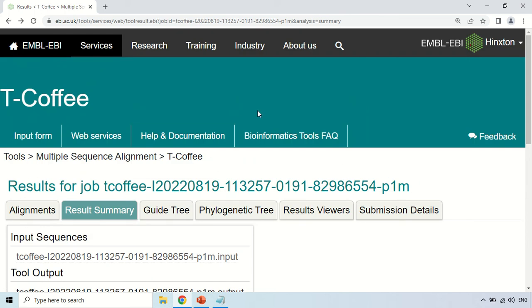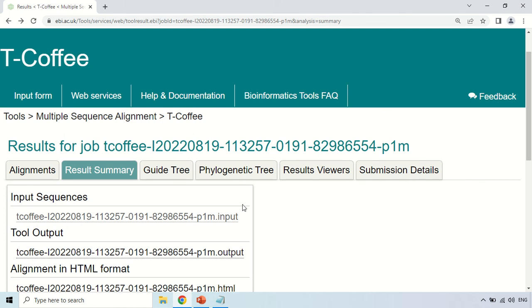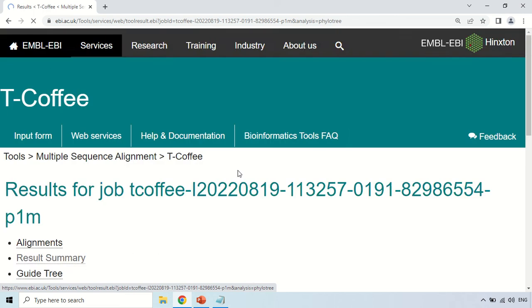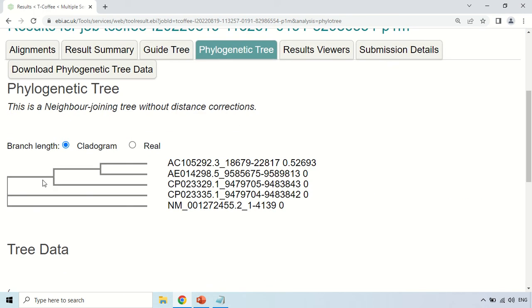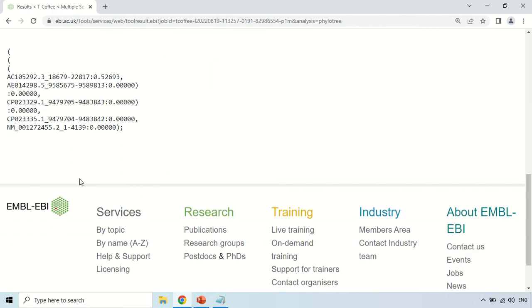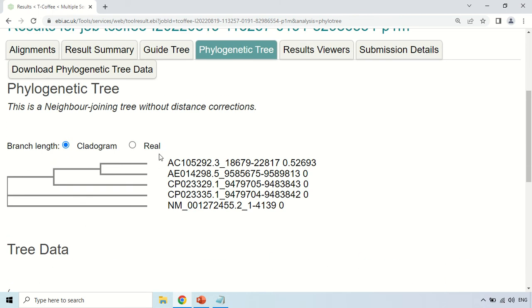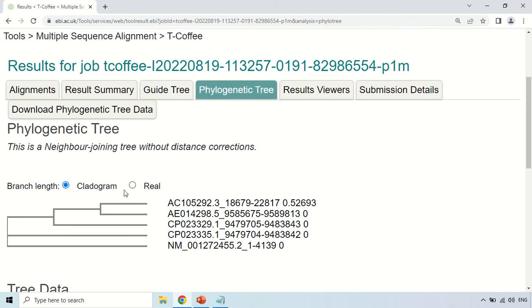The next section is Phylogenetic Tree. By using T-Coffee, you can also construct a phylogenetic tree. Just click under the Phylogenetic Tree section. Now you can see the phylogenetic tree of all five sequences, with their accession numbers shown. This is the tree data and the phylogenetic tree or cladogram. You can also download the phylogenetic tree data by clicking 'Download Phylogenetic Tree Data'.